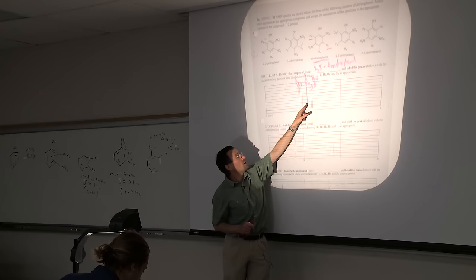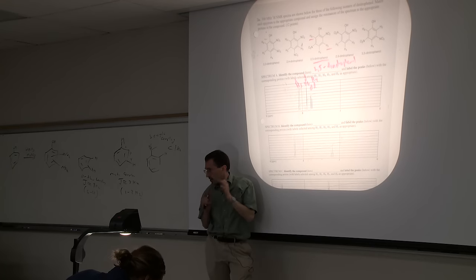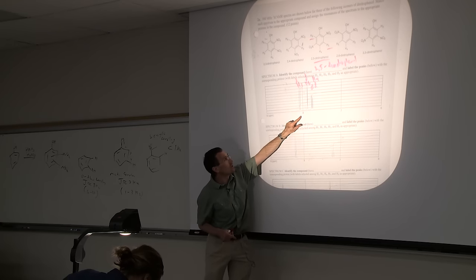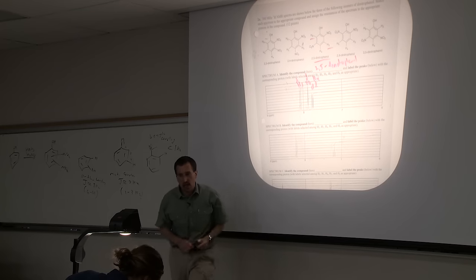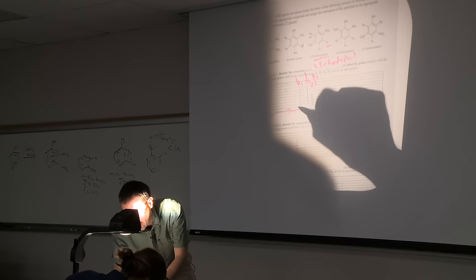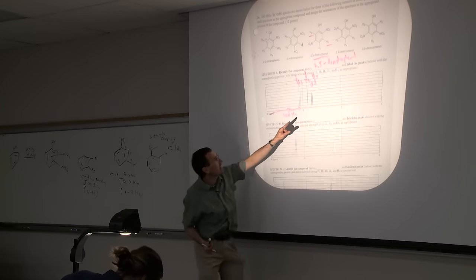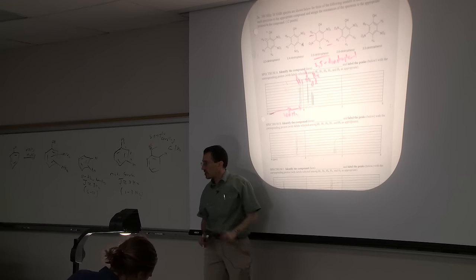These two lines are really close together. They're not a tenth of a PPM. They're much closer to a hundredth of a PPM. Now remember, we don't have much of a ruler, but the distance from 8 to 9 is 300 Hertz. So I have a little bit of a calibration here. That's 300 Hertz. And so even though I didn't slap a ruler on it, I can say, okay, that's a little bitty coupling constant. That's just a couple of Hertz. So that's what I mean.